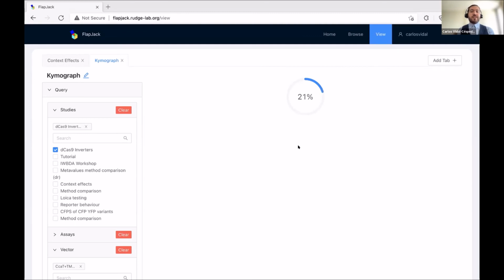How did you find the interface so far? Are you having any troubles? Did you find it intuitive to use? Any feedback is appreciated.